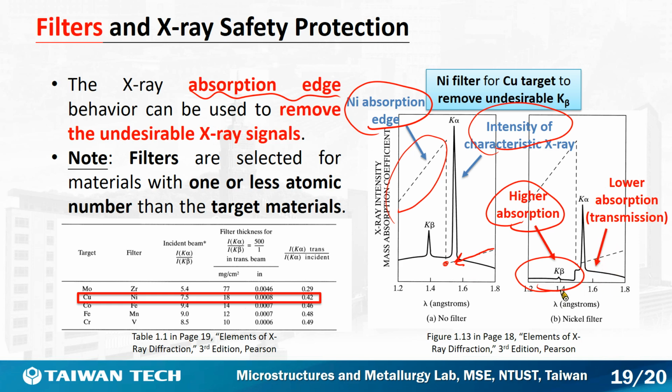Okay, so we can use this nature to remove undesirable X-ray signal.